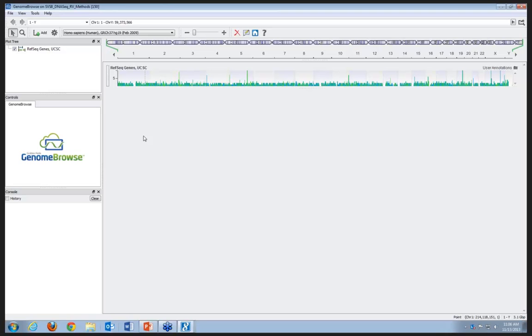If you have a way to manipulate that to look like diploid or look like some kind of a log additive numeric representation, then there's more that we can do. Within GenomeBrowse, any standard file format, so if you have just a standard BAM file or standard VCF, we should be able to annotate and navigate within that and work on it. But in general, we are species agnostic, is what I'd like to say.